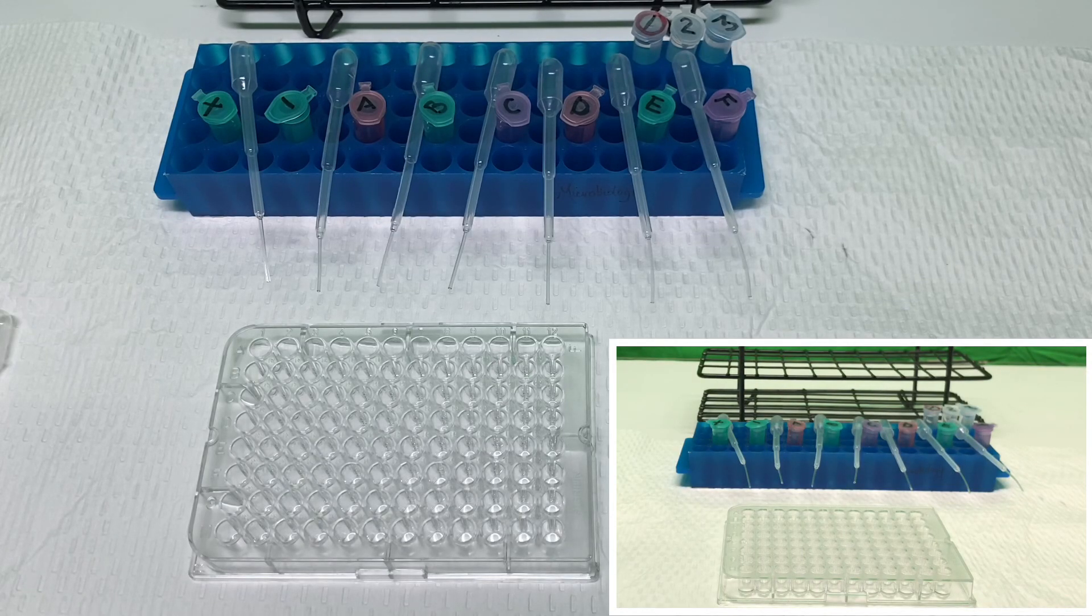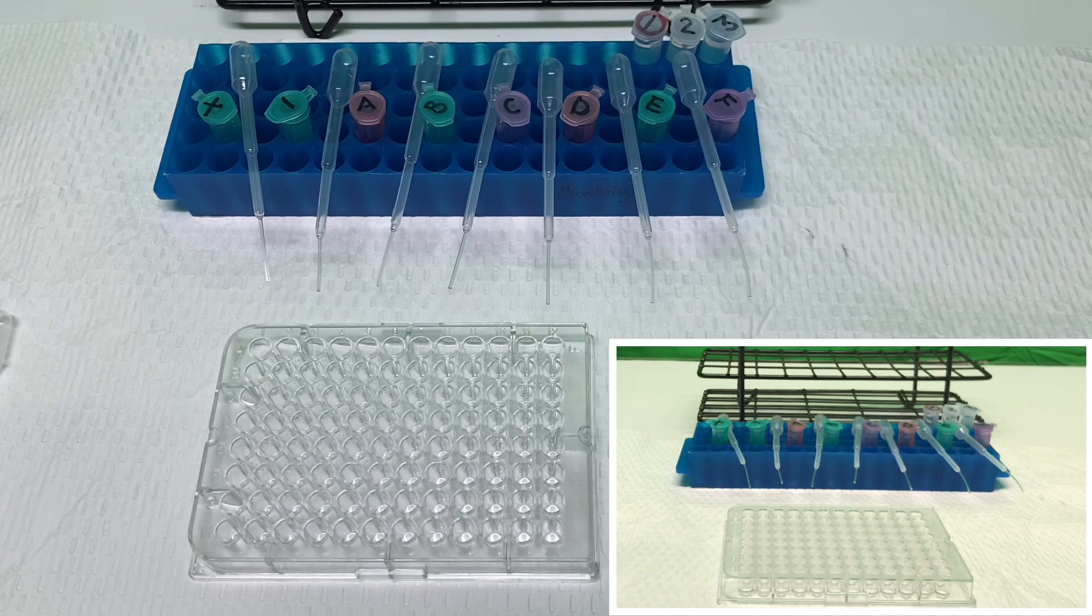Laboratory 40 focuses on the ELISA. The main concept here is to learn how to use primary and secondary antibodies as a way to detect certain antigens present.